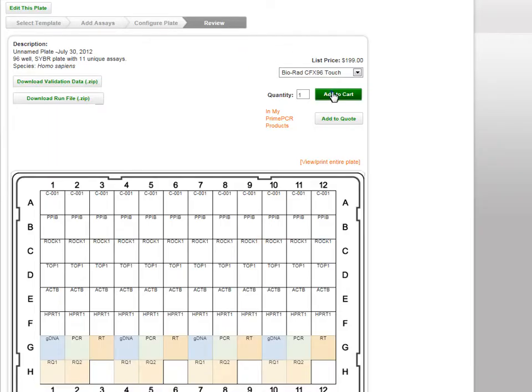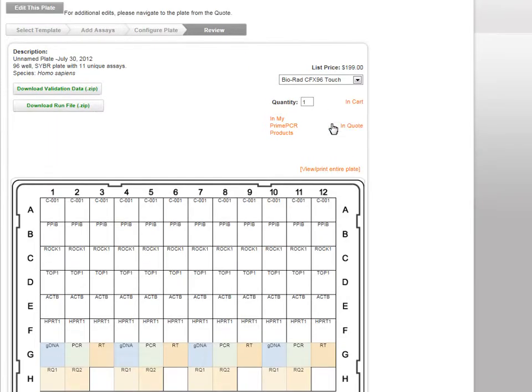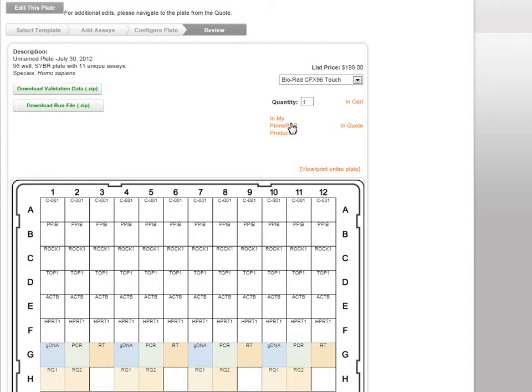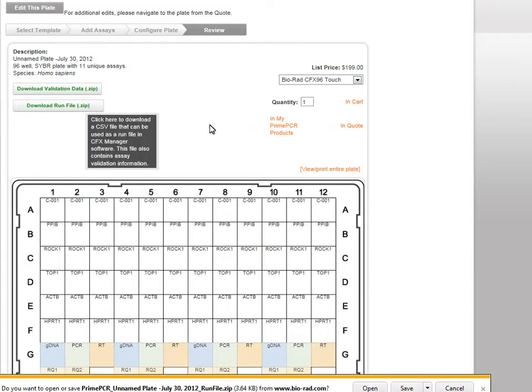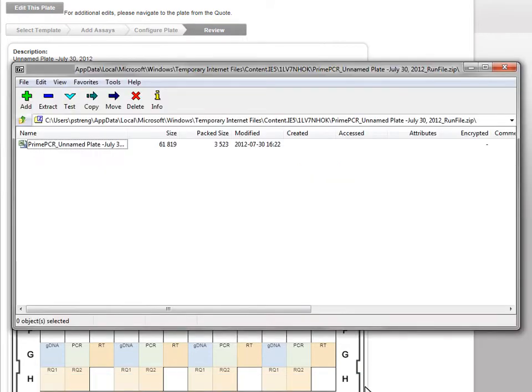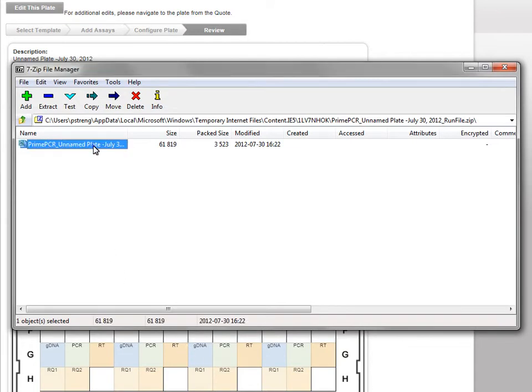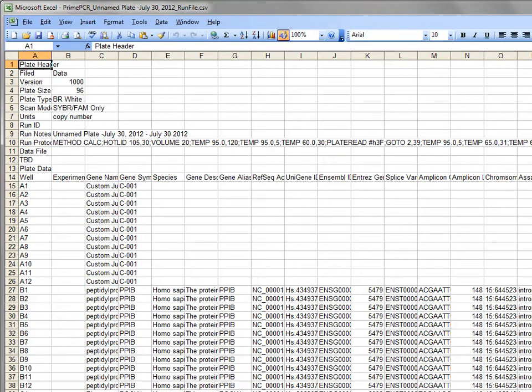On the Plate Review page, you can add your plate to the cart or you can also add the plate to a quote. Validation information for every assay present on the plate can be downloaded by clicking the Download Validation Data button. A plate run file, available in CSV format, is available. To download this file, click the Download Run file at the top left of the screen. You can either save or open this file. This file contains information for loading and running a plate using CFX Manager 3.0. It also contains validation information.